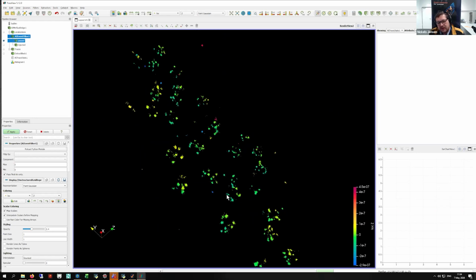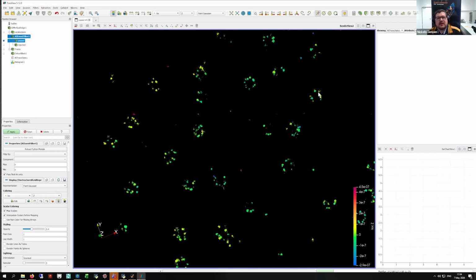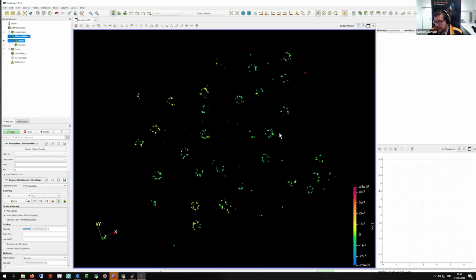As you see right now, the pores are not complete, so we would image a bit longer to get as much of the pore as possible. Typically, with the settings, we get to a labeling efficiency of 60% of the possible positions that we can measure. As you always have two, you can get a whole nuclear pore in the end with the eightfold symmetry in some cases.